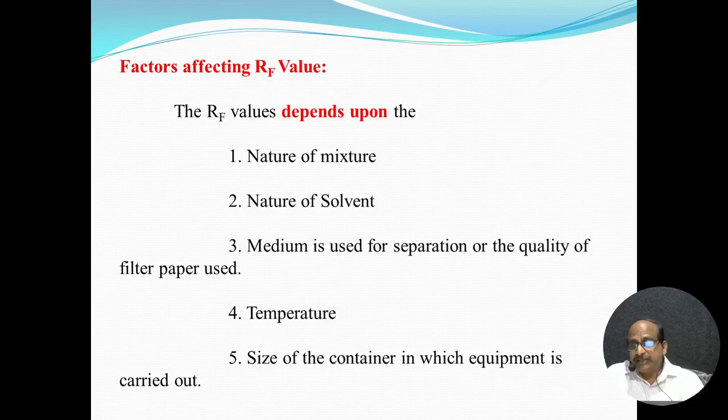Is there any effect on the RF value? Are there any factors affecting it? Yes, so many factors affect the RF value. One is the nature of the mixture. If the mixture is different, then automatically your RF is also different. What is the nature? Solvent or solute, different types of particle size. That also causes variation in the RF value.